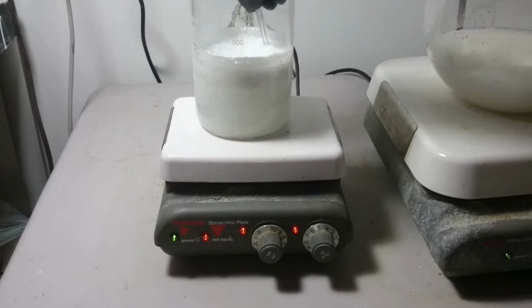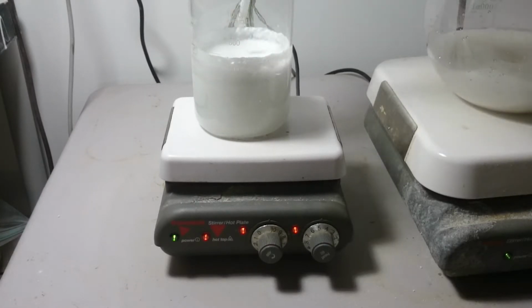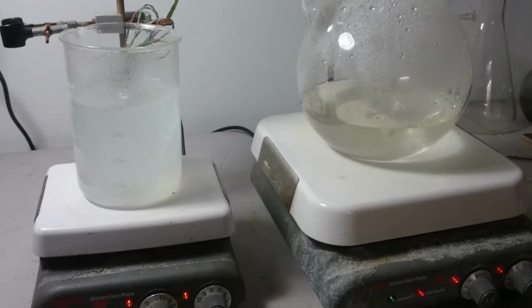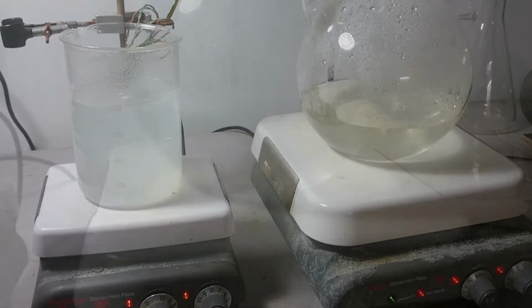This reaction produces calcium carbonate, which is much easier to separate. It settles out much faster than calcium sulfate, and is much easier to clean up simply by using a bit of hydrochloric acid. While adding an additional reaction step to producing propionic acid does cause some loss of yield, I still think this is better than using calcium propionate directly.